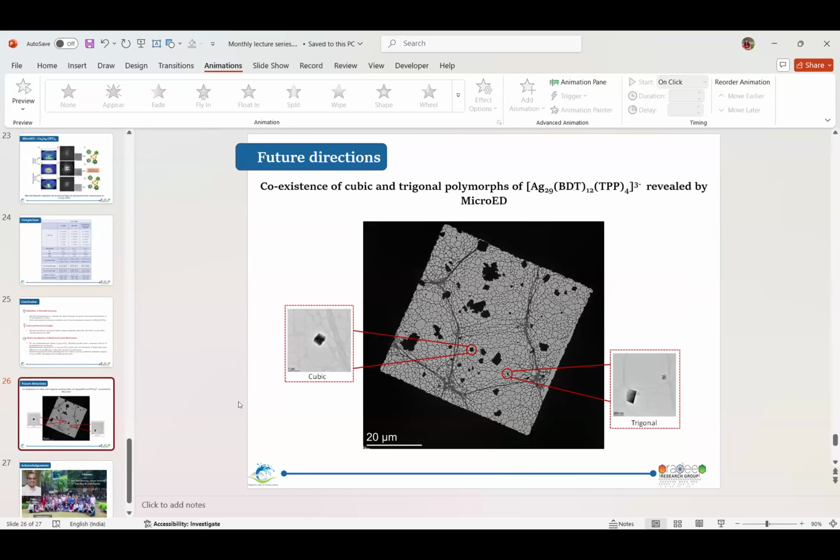Just for this, the first paper is by Ute Kolb, who diffracted in 3D, right? Not by this guy, the first 3D. The Tamir Gonen group, it's Ute Kolb, or Ute Kolb. She's the one who did this tomography first. I cannot hear you properly. I'm telling that this lady, Kolb, has done the first 3D electron tomography. Although the structure was solved by the Tamir group, the first 3D was developed by this lady, Ute Kolb. Okay.